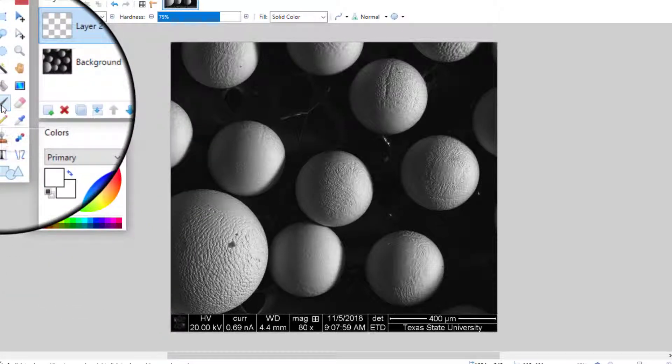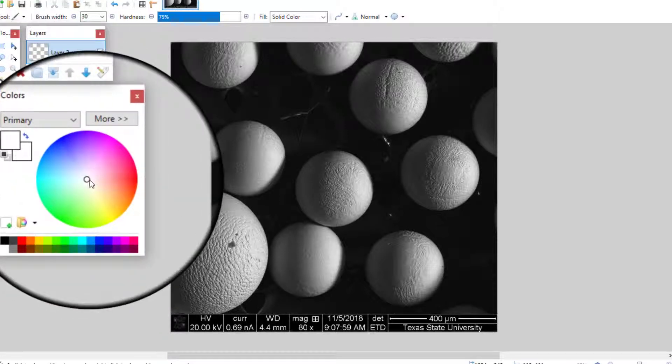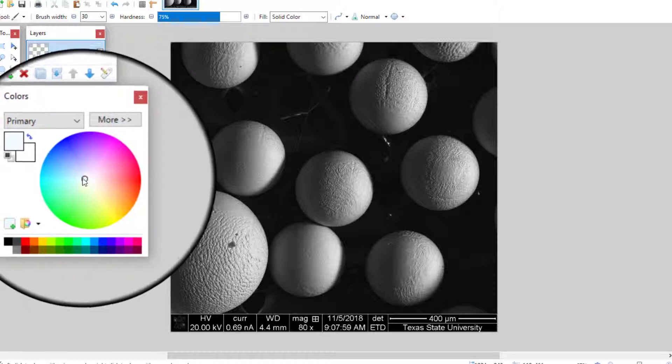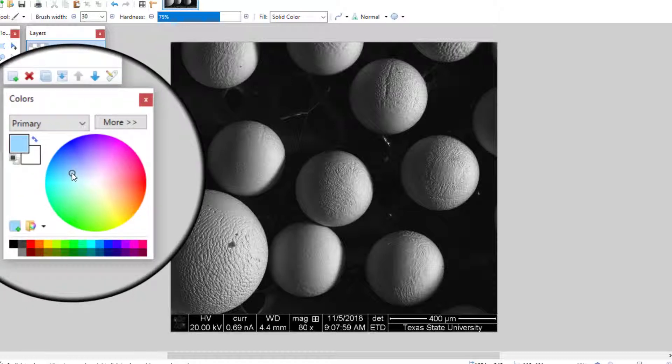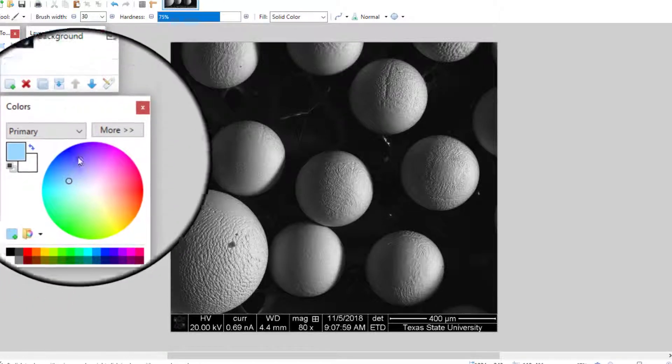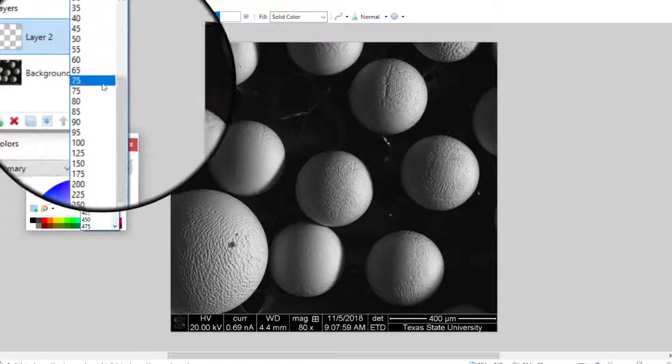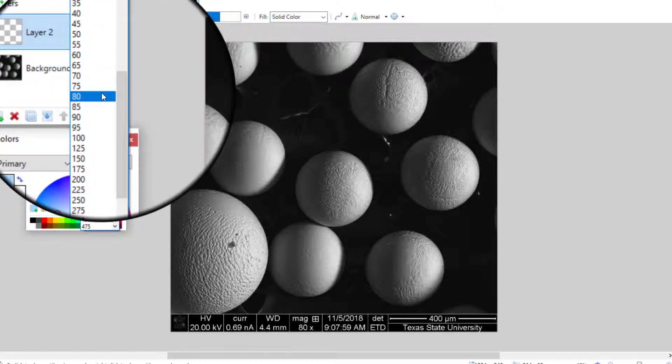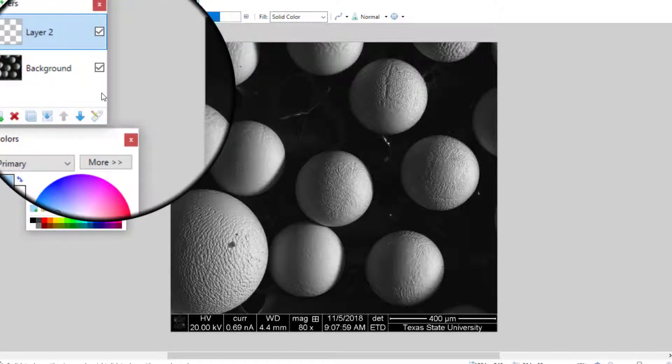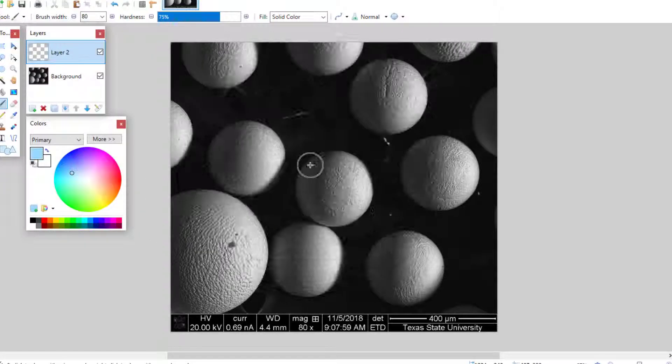Then select the brush tool and the color you want. Increase the brush size so you can quickly color the region and begin painting over the area.